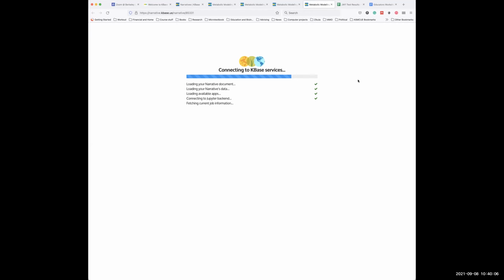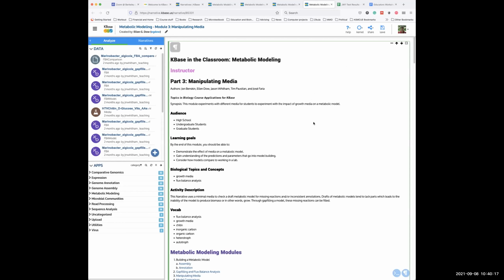I still got a little bit more time here. So what we found out in our research, in our work, is that they could do that, but then the students started exploring KBase and they started finding really interesting things. Like there's phylogenetic analysis that they can do where they could take their whole genome, compare it to related genomes and build trees and make predictions about which ones are unique and which ones are not.